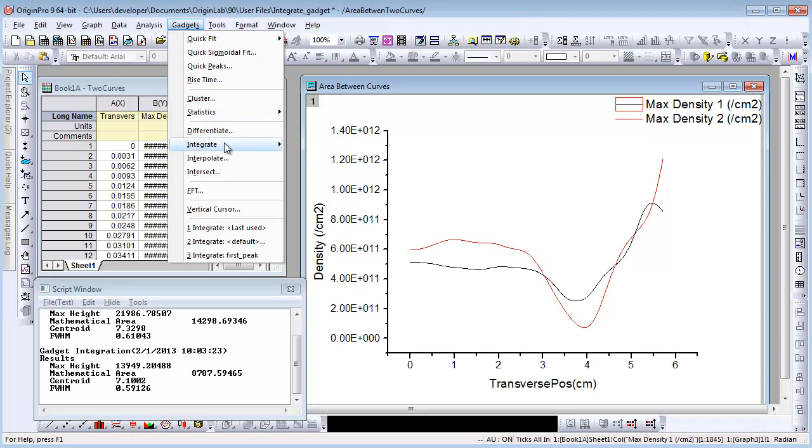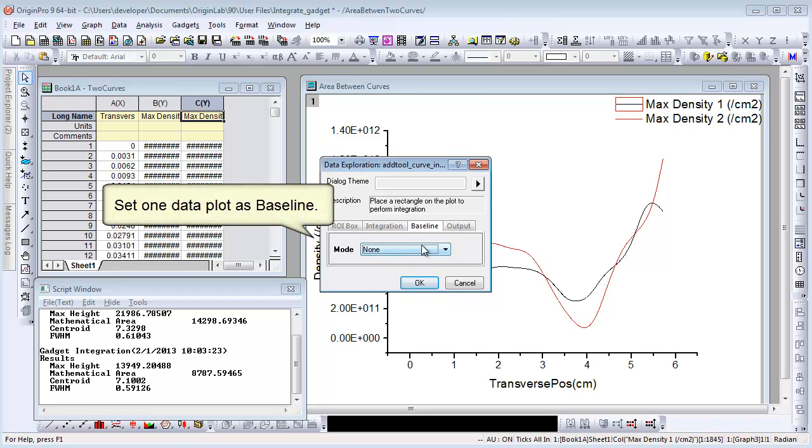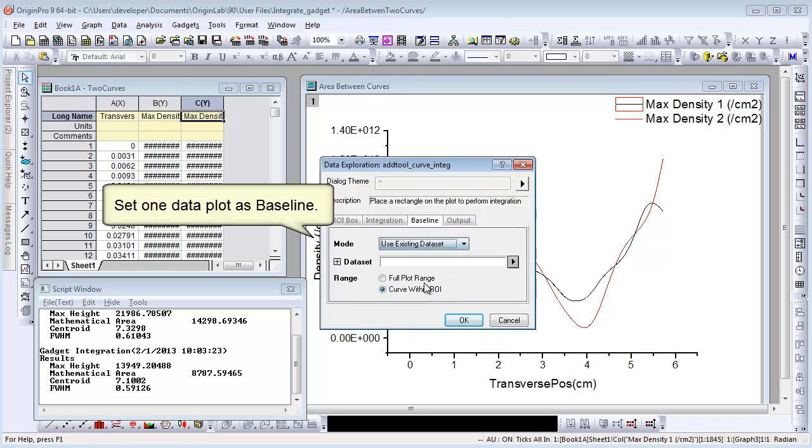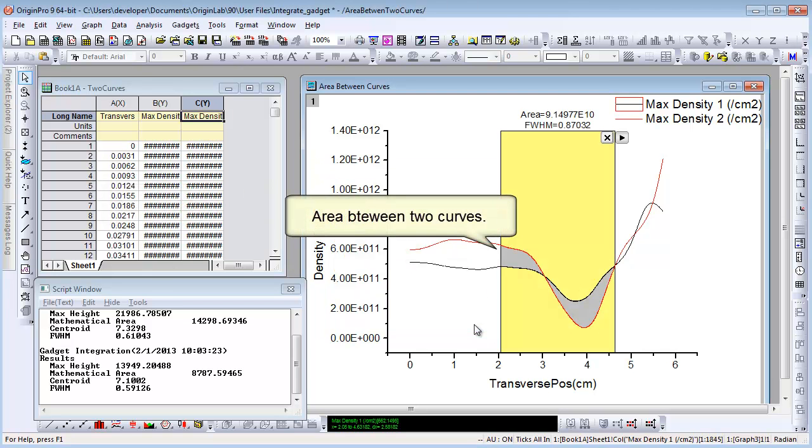Let's choose Gadgets, Integrate, Open Dialog this time. The gadget is applied to the active data plot, MaxDensity1, so we can set MaxDensity2 to be a baseline. Choose Using Existing Data Set and choose Plot 2. Click OK. The area between two curves are calculated.